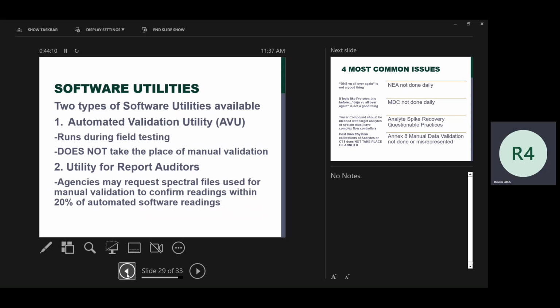So literally, he's going through the manual quant on the CO, and the CO is not quanting. He's like, what's going on there? There's something interfering with it. And at that point in time, we're using a third party to do a manual validation. So he looked at the data, and he says, I think this might be cyanide. It's 40,000 ppm of cyanide. It could have killed me, but I didn't die, obviously, because I'm here. And I lived to tell the story, but he called me and says, oh my gosh, I'm so glad you're alive. I said, well, I uploaded the data, dude. He lived. And that was Marty Sparks that did that, yeah.